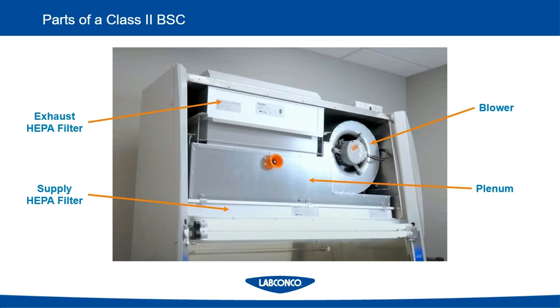So in the next section, we're going to cover the different types of Class II biosafety cabinets. And although all of them are going to have an exhaust and a supply HEPA filter, the plenum and the blower configuration are going to vary.